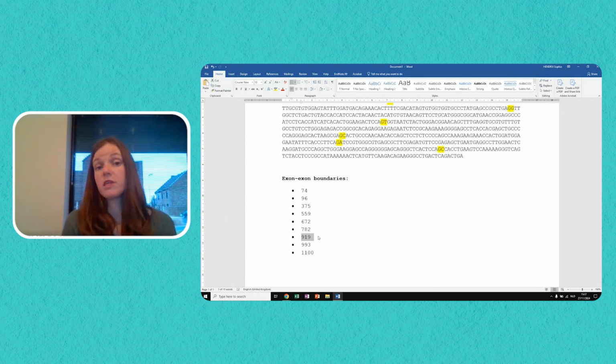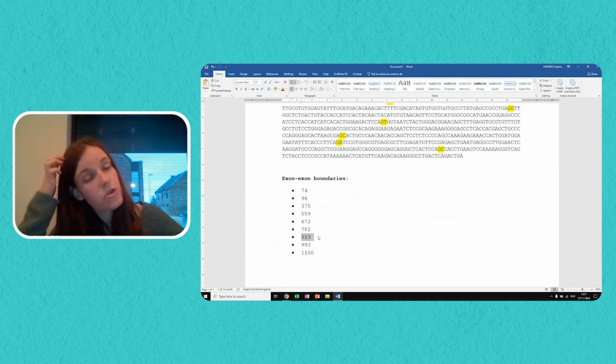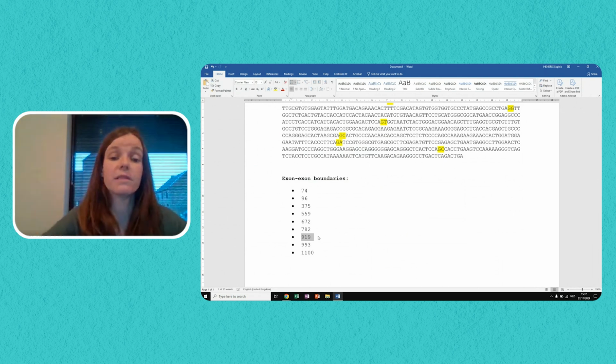Let's say the intron in between is relatively short, then it might still be possible that genomic DNA would also be amplified, but then you would be able to see this in the dissociation curve, as this would yield an additional peak in the dissociation curve at a higher melting temperature, because a longer product has a higher melting temperature.